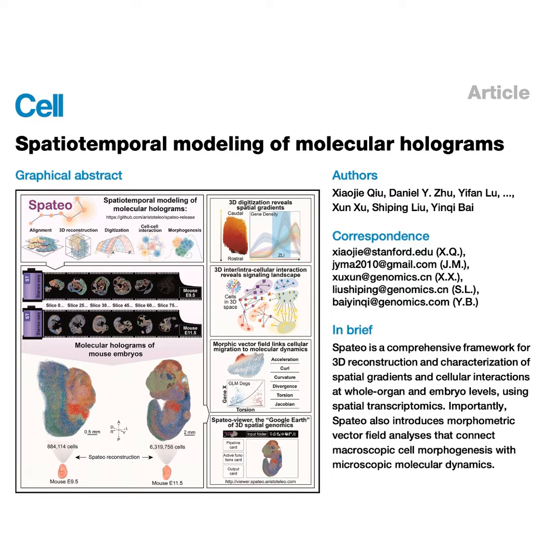Right. So by applying morphometric vector fields to the 3D data, the algorithm can mathematically isolate the exact spatial coordinates of the tissue undergoing high torsion. It filters out the millions of static cells and leaves you with only the specific cells that are actively driving that physical twist. Oh, wow. So once you have isolated those rotating cells, you just query their transcriptomic data. You look at their RNA. Exactly. And by doing this, the researchers were able to pinpoint the exact morphogenic drivers, specific transcription factors like TBX2 and PITX2 that are highly expressed in the twisting region.